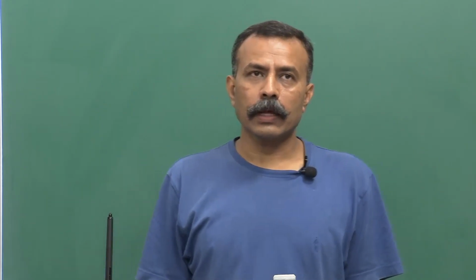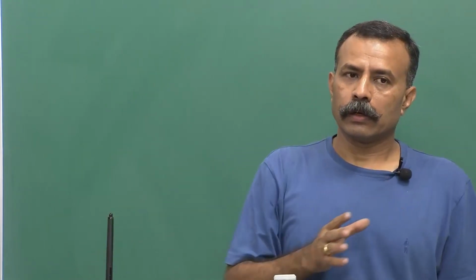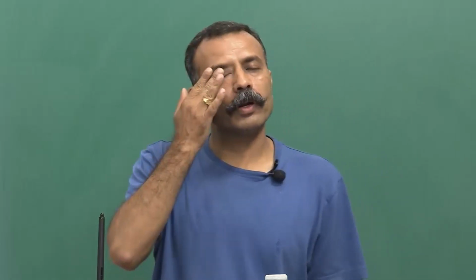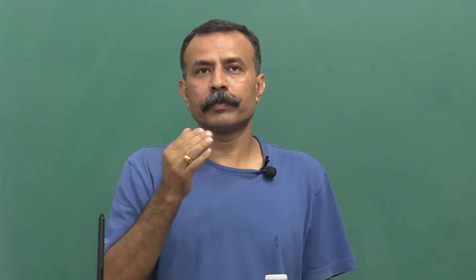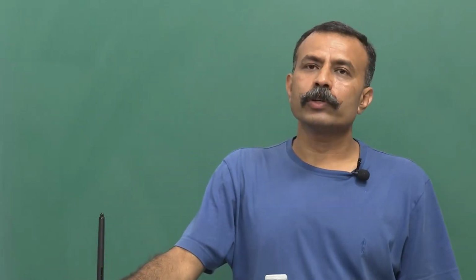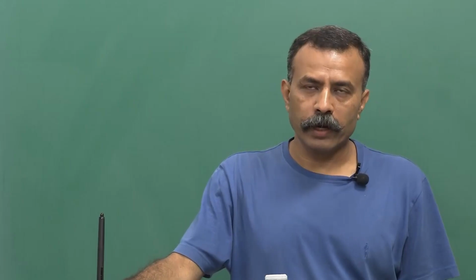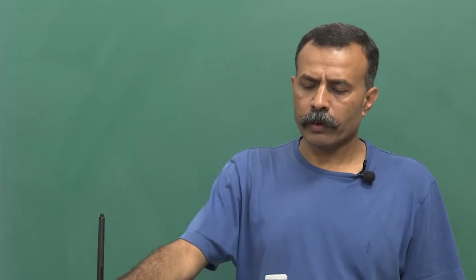So, in the last class, we walked through a virtual lab, which I wish most of you develop someday. What are the points which have to be kept in mind in the whole layout and the budget constraints that you face?